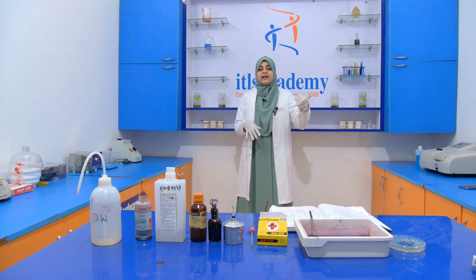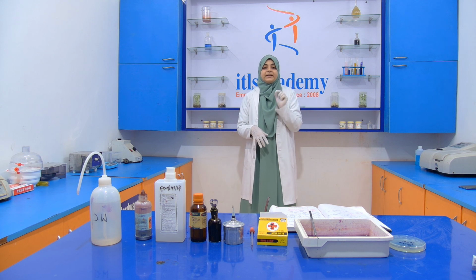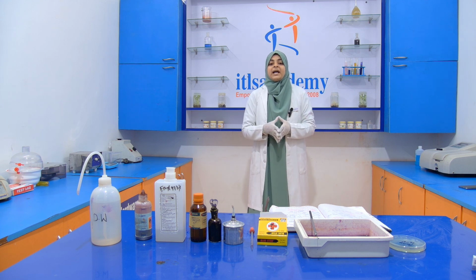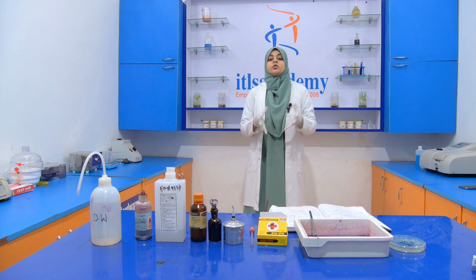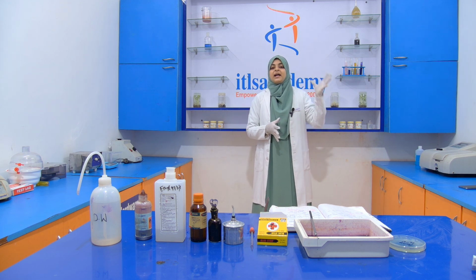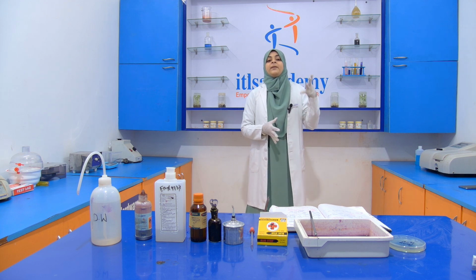It enhances the color of that particular bacterial cell. We all know that microorganisms are colorless organisms. If colorless organisms are visualized under the microscope, they cannot be seen, or maybe we can see them, but the quality of that image is not very good.